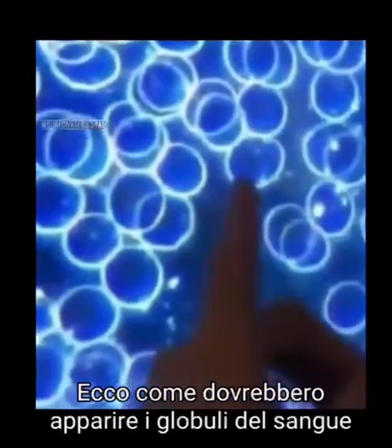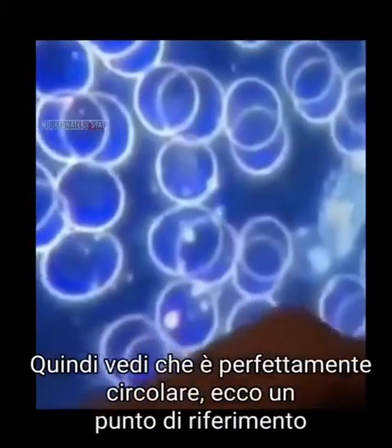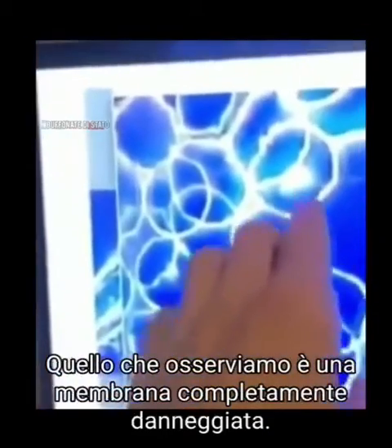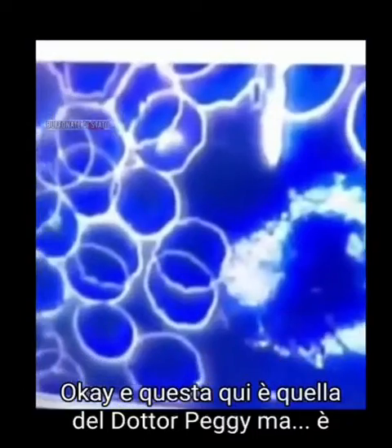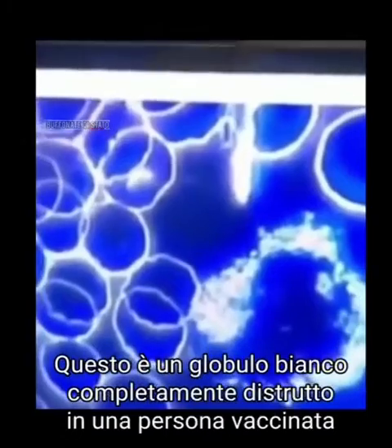Let's look at this live. This is what blood cells are supposed to look like. A white blood cell, you see the activity, right? And the membrane is the way it's supposed to be, right? So if you could see, it's perfectly circular. This is the visual reference on how good blood cells should be. Here we're seeing a totally corrupted cellular membrane. Okay. And this here is what, Dr. Peggy? A white blood cell, but it's destroyed. This is a white blood cell that has been totally destroyed in a vax person. Yeah. Right.